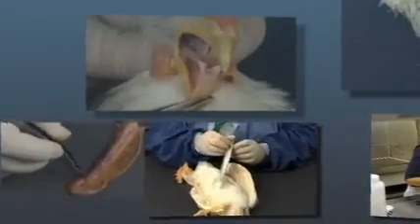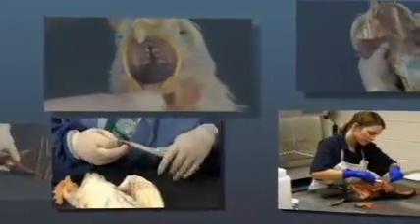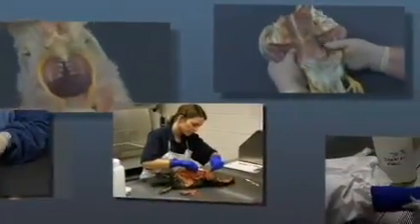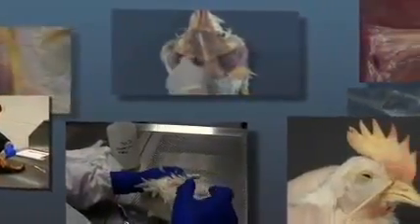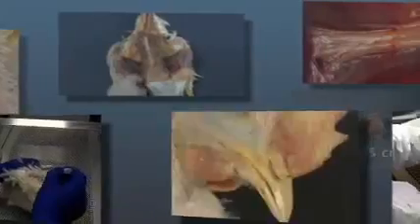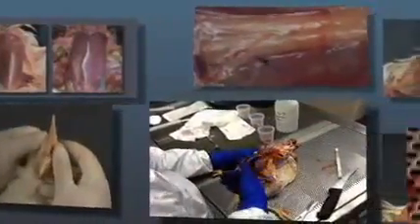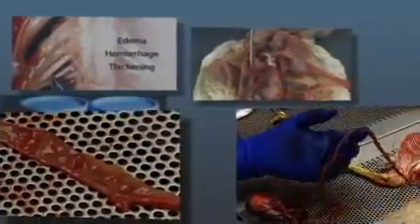This concludes our demonstration of the avian necropsy examination. For educational purposes, the authors have presented a complete necropsy examination. With time, you will soon develop the skills and judgment necessary to perform an efficient exam. While each step of the exam may not be performed in every case, it's important to become comfortable conducting a thorough examination. Practice is the only way to truly master these techniques and to develop the experience necessary to be able to differentiate normal from abnormal findings.